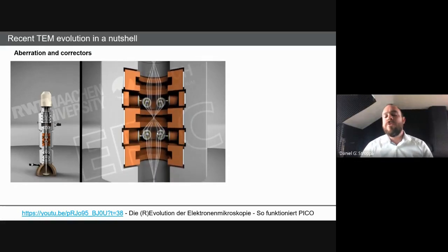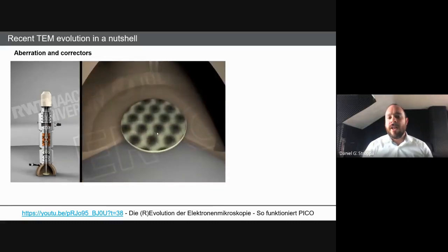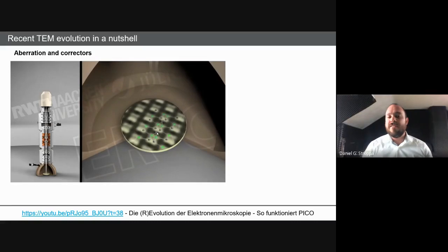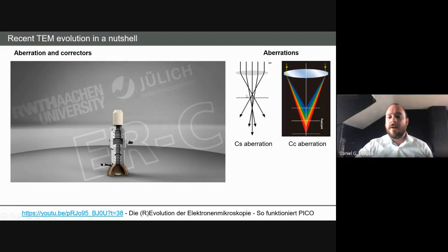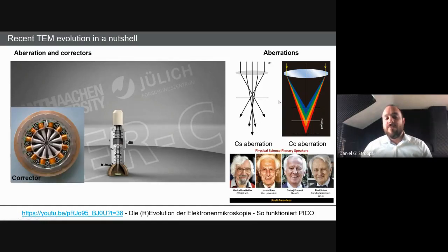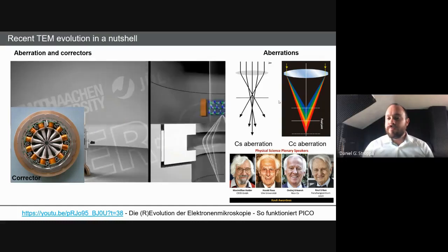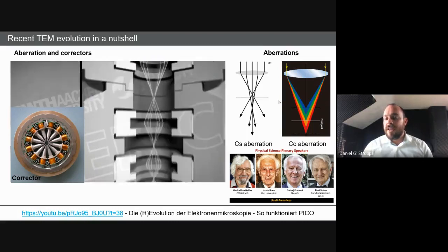And this was a breakthrough that was somewhat recent. The first implementation of it was at the end of the 90s. The first commercial system was in the beginning of 2005, if I'm not mistaken. And those four gentlemen here are the leading guys in this field, the ones who calculated the optics, implemented the hardware, and tested it. There's even a bit of a joke that the only reason they did not get the Nobel Prize is that there are four people involved, and they just cannot agree on the top three in this area.